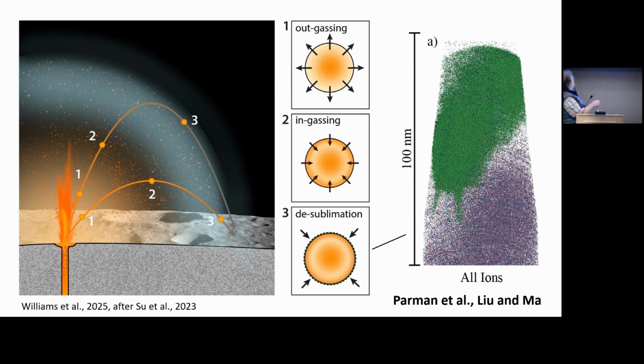If you're not familiar with atom probe tomography, we're imaging individual atoms in 3 dimensions, and you can image tens to hundreds of millions of atoms and reconstruct where they were and what they were using time of flight mass spectrometry. So here's the glass, and here's the surface coating, and again, here's a 100 nanometer scale bar.